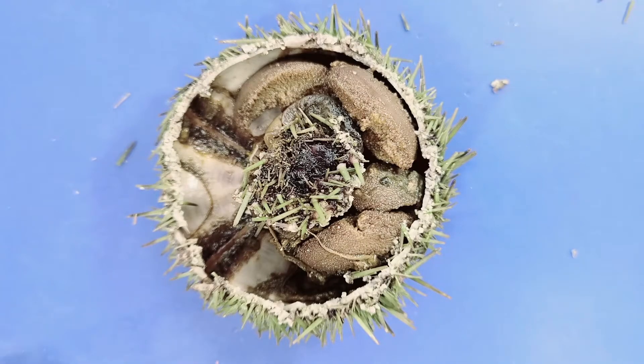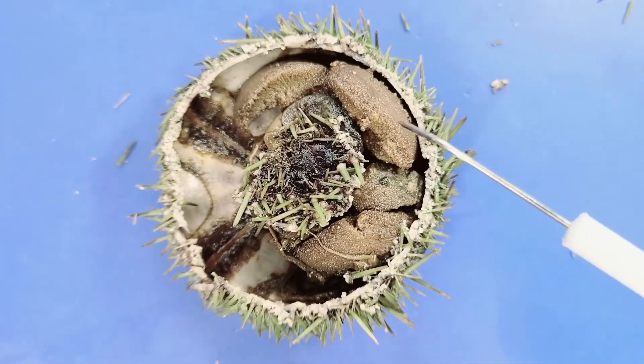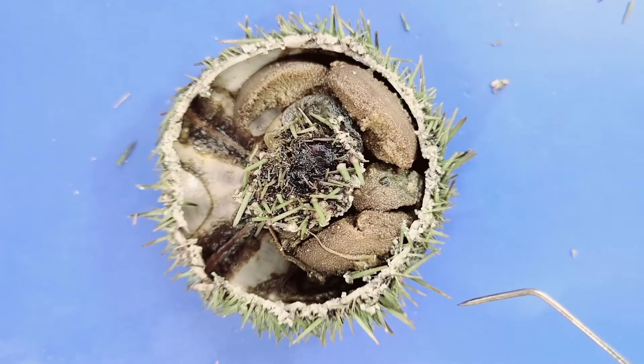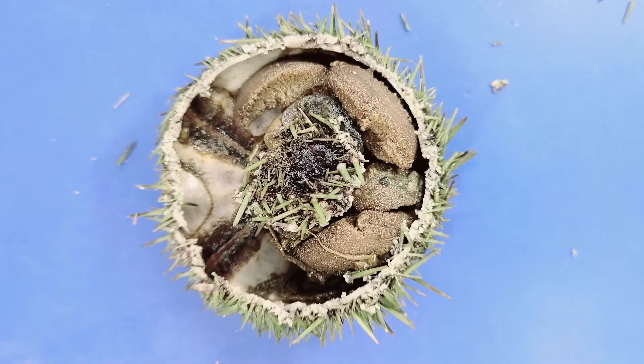The most obvious structures are the five gonads. This sea urchin could be male or female — there's no way to tell unless we actually see it reproducing. These gonads would be either testes or ovaries. Testes release sperm while ovaries release eggs. Both sperm and eggs are released through small openings near the anus called gonophores on the genital plates.